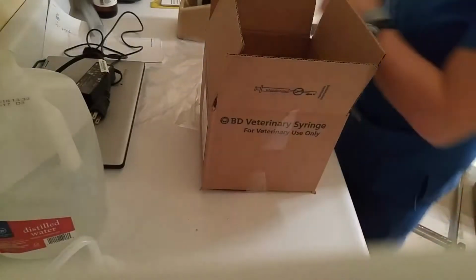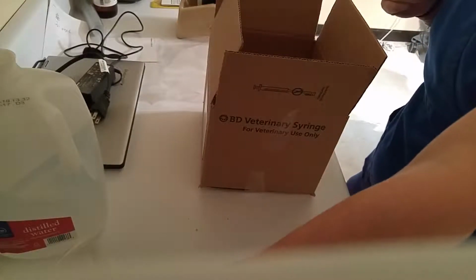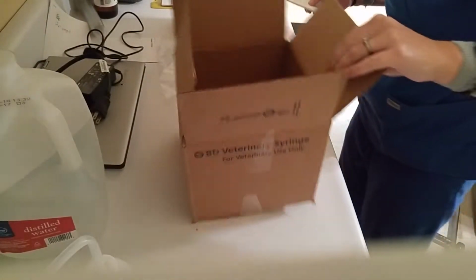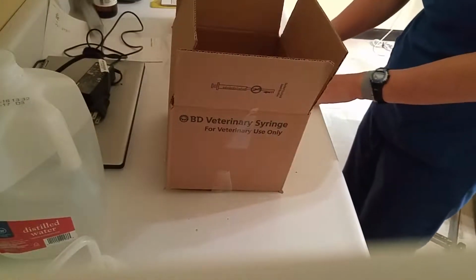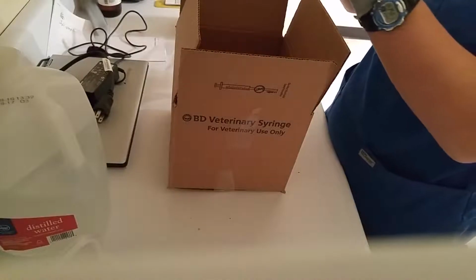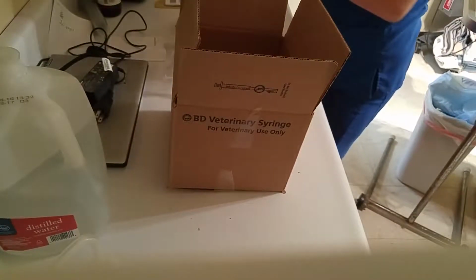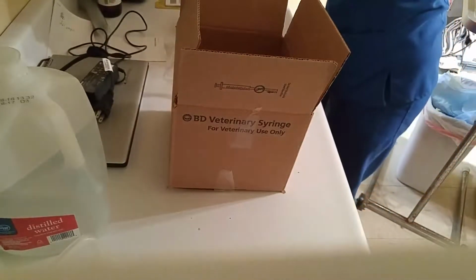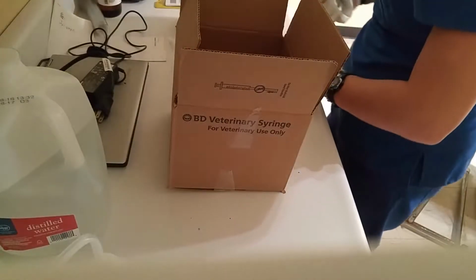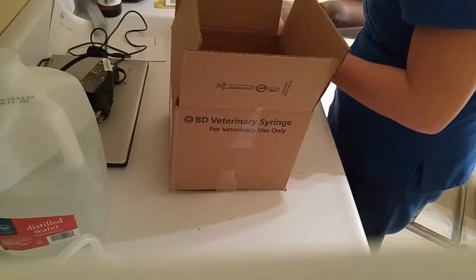I'll go ahead and get a batch of samples ready to send out to the lab. We're going to make sure we have adequate paper towels. I'm going to take them and wrap around the sample. The sample is labeled, it's got all the information on it, where it came from, patient that it's going to. We want to make sure that it matches the requisition that we have over here, which it does. So we're going to take this, wrap it in plenty of paper towels, and stick it inside a baggie just in case there's any spill. I'm going to make sure that it gets absorbed.